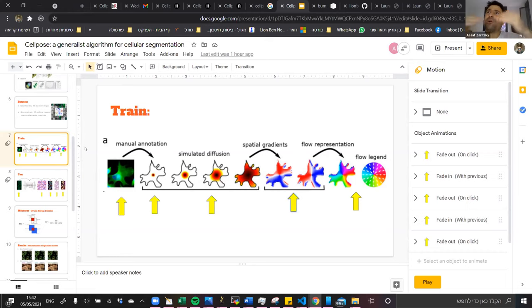I think the idea is you do some processing, and here it's clever processing, right? It's not trivial, building these maps, and then giving the network the task of learning this representation. And also, if I think about it from an intuition point, tell me, Leon and Alon, if you agree, I'm not sure about that: in a lot of the classic image processing cell segmentation and nuclear segmentation tasks, the idea was watershed algorithms, which basically go and find the basins, so doing something similar in terms of optimization. Is it relevant? They talked about in the paper that watershed succeeded when the distribution was evenly spread. So they created a distribution that would be evenly spread.